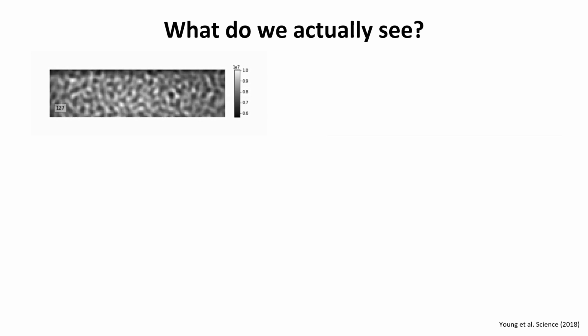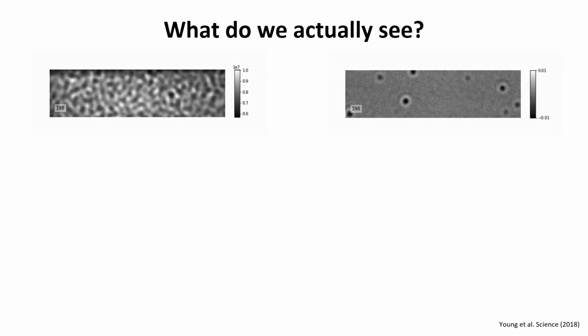Before I explain what exactly we do, I want to show you the movie after we do the image analysis. And here it is. It's the same movie, only here what we see is what we call ratiometric imaging, where we take out the background and therefore we can see the signal. And here what you see is particles or proteins land on the interface. They create a signal and then they disappear.